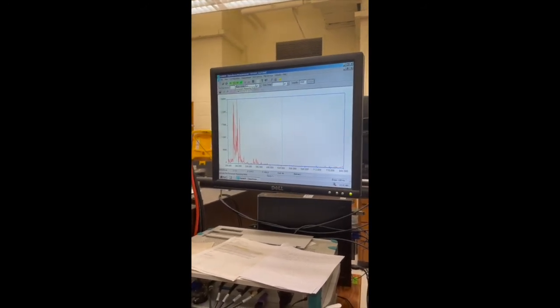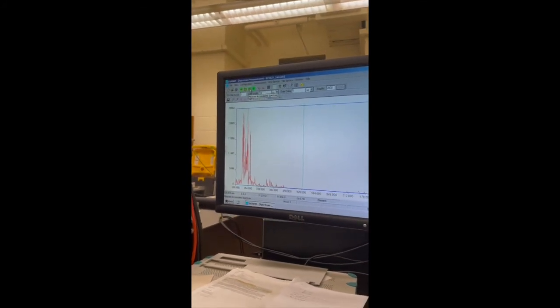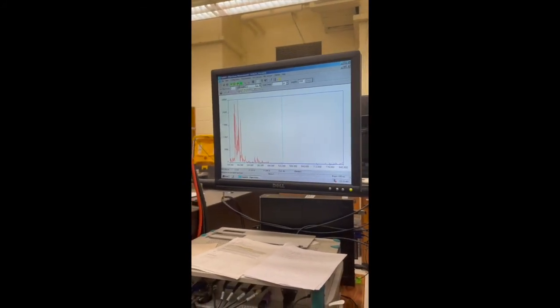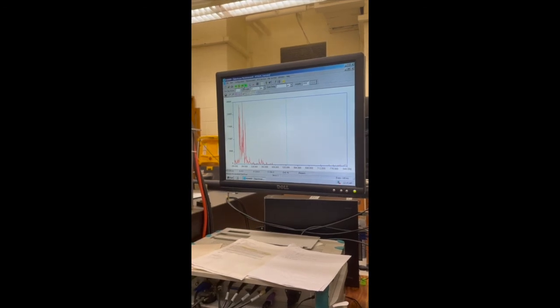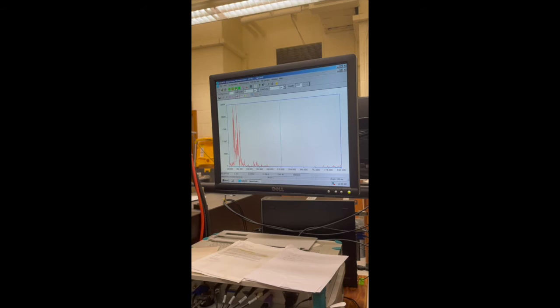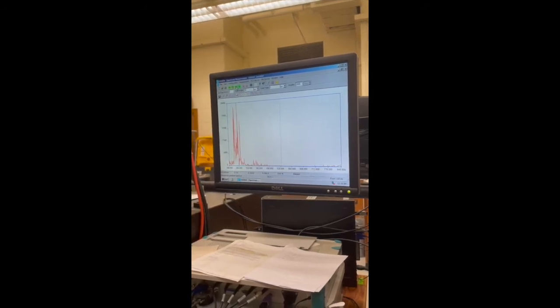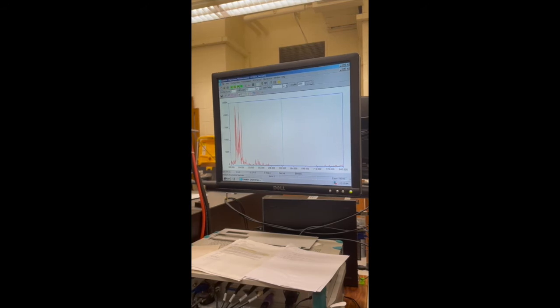Now if you go over one more, that's the measure accumulated spectrum. That's what we want to do. You want to accumulate and get the average of 5 spectra. So you set the number to 5. Now you're going to want to press this button. And then your lab partner will move the steel piece in between each of those shots.